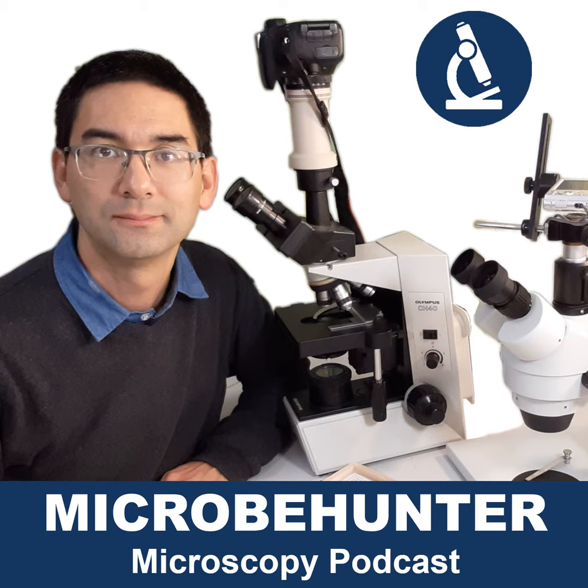Yeah, I don't know. That's pretty much it that I can say for right now. My advice is for your first microscope, I know opinions go apart here on this issue, I know, don't spend too much money on it, okay? But don't get yourself the cheapest device either, okay? I know that's kind of a little bit of a contradiction because what's the ideal thing?